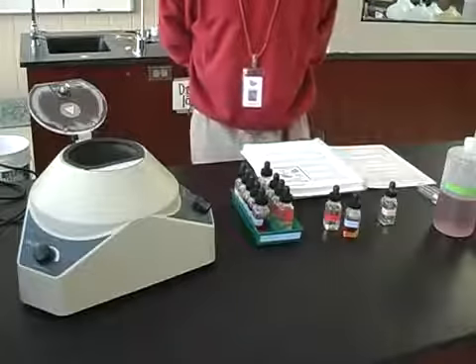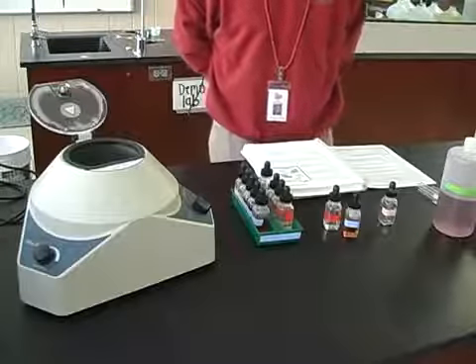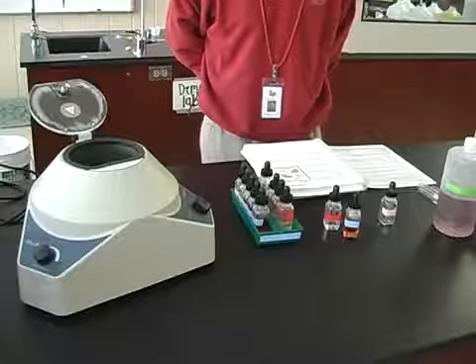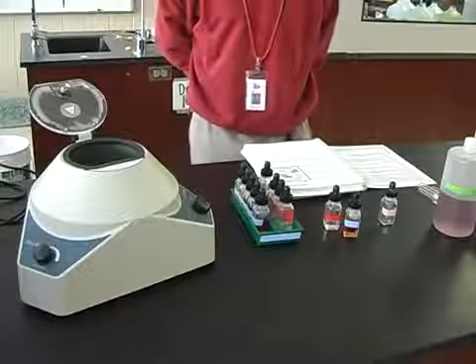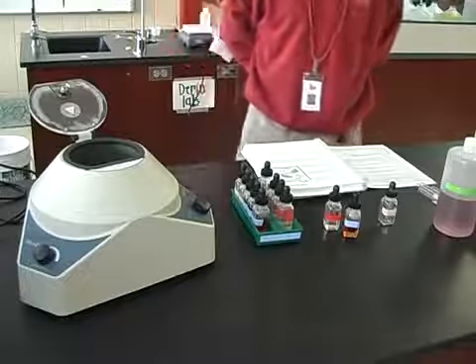The next page, it says on mine 125, washing precipitates. It's almost always necessary to wash precipitates to free them from ions, which might cause confusion later in the steps. To do this, add 1 to 2 milliliters of distilled water to the precipitate, stir it again, centrifuge it, and discard the wash water. Sometimes the directions will tell you to include a specific reagent in the wash water.